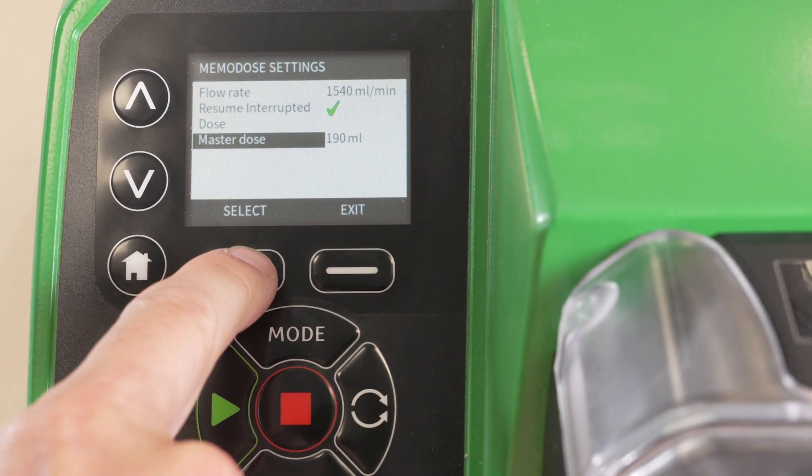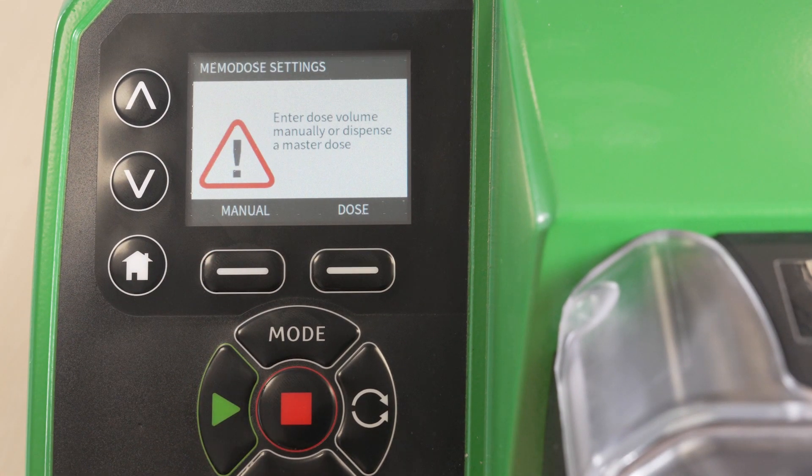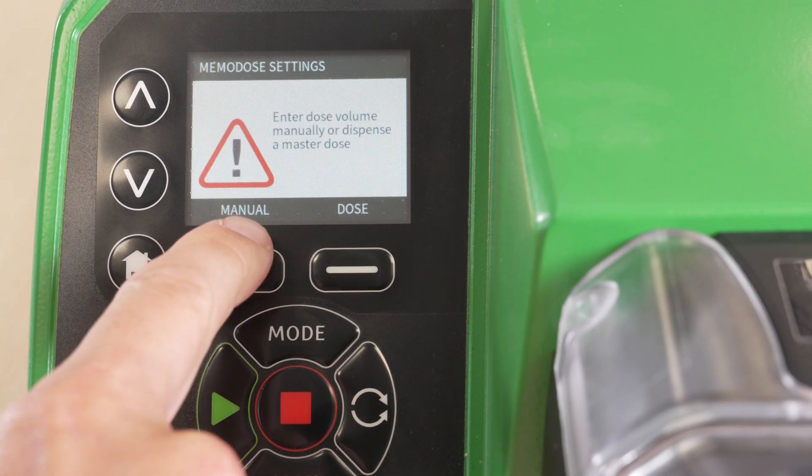Select Master Dose. There are two options for entering a dose: either manually via the keypad, or by physically dispensing the required volume of liquid into a container. In this example we will enter the dose manually via the keypad.